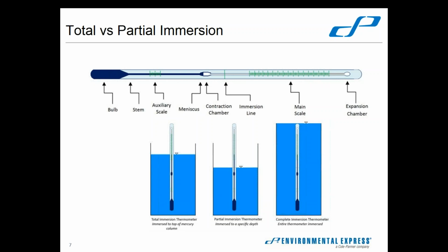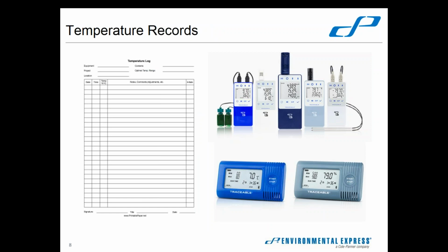So check your thermometers. Make sure you're using the correct type of thermometer, and if it is a partial immersion thermometer, make sure that you have it inserted to the correct level when you are using it.